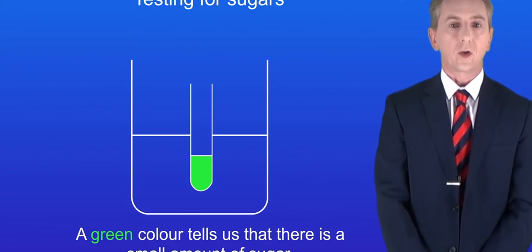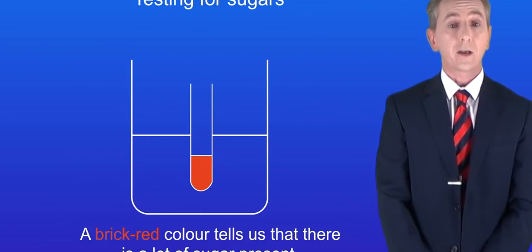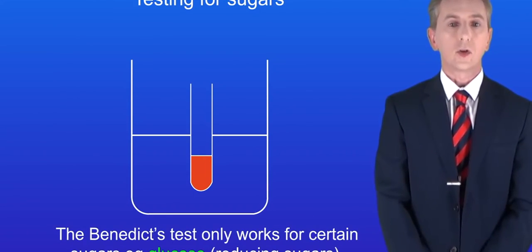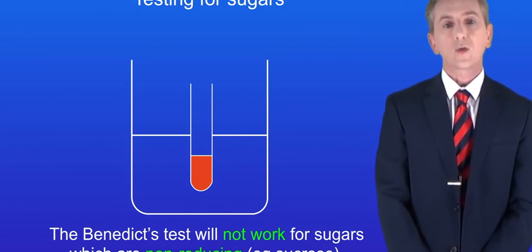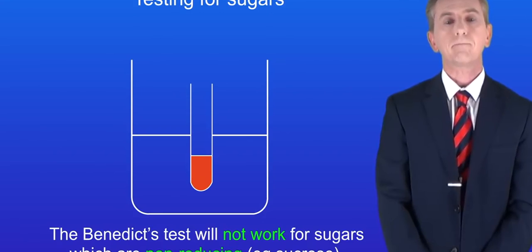A green colour tells us that there's a small amount of sugar. A yellow colour tells us that there's more sugar present, and a brick red colour tells us that there's a lot of sugar present. Now, the Benedict's test only works for certain sugars such as glucose. Scientists call these reducing sugars. The Benedict's test will not work for sugars which are non-reducing such as sucrose.